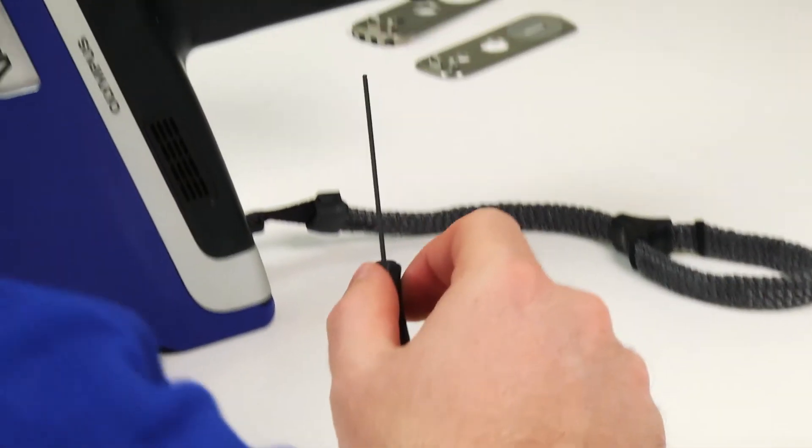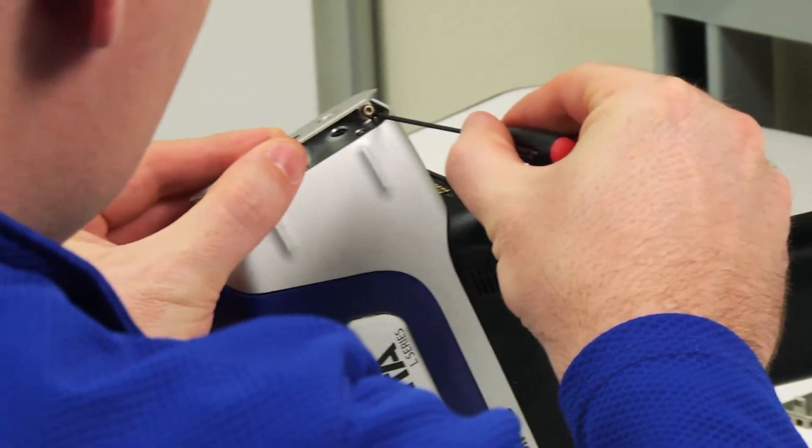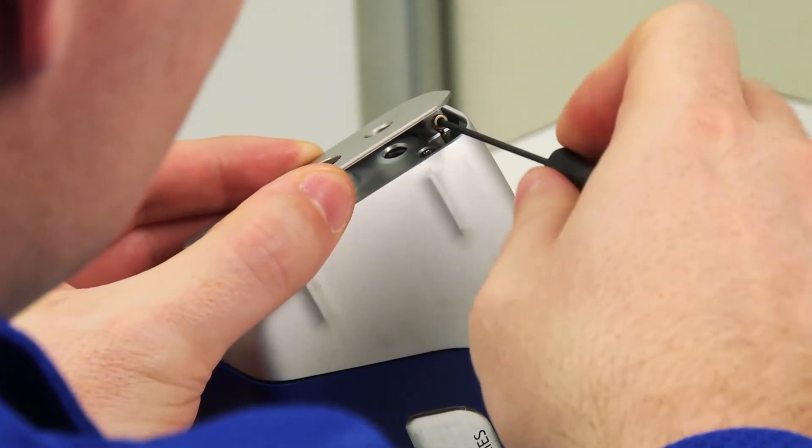Use the allen wrench supplied with the hot heel to remove the screw holding the tether to the faceplate. Be careful not to lose the screw or the washer.